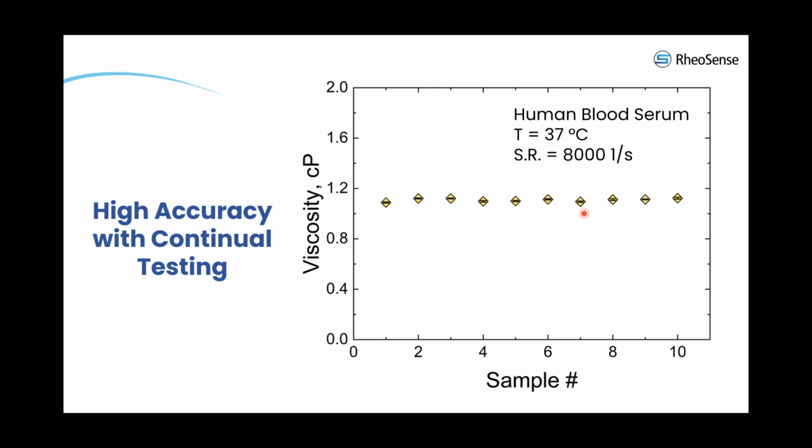So this solution, cleaning solution, is also used as a standard before and after the serum samples were measured. And before all these measurements were even started, we also measured against a viscosity standard. So a medical grade viscosity standard, MGVS 20, that you may be familiar with already.